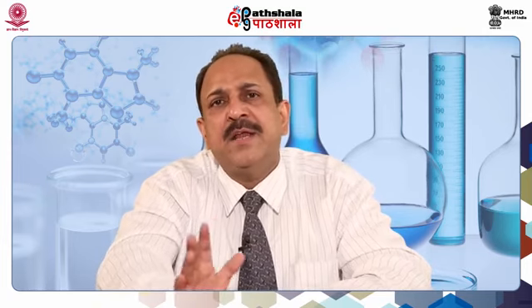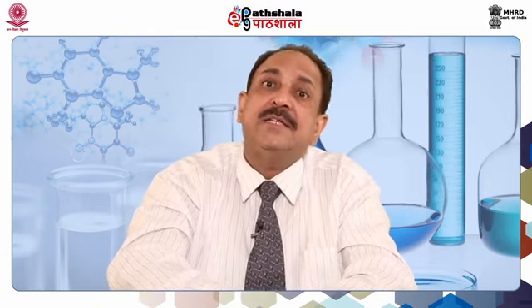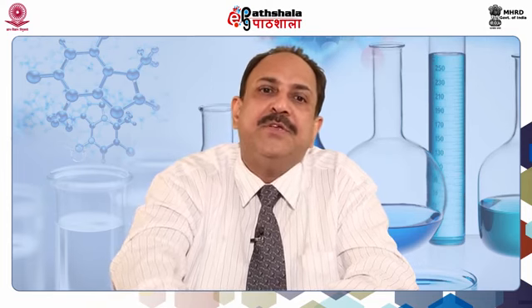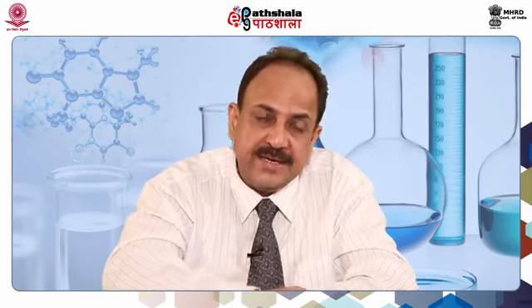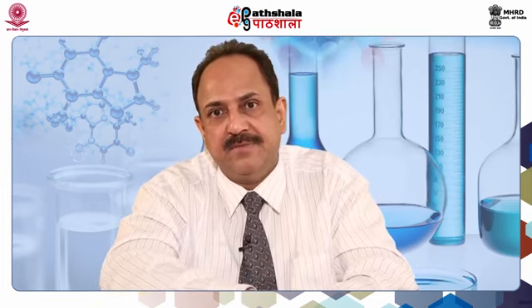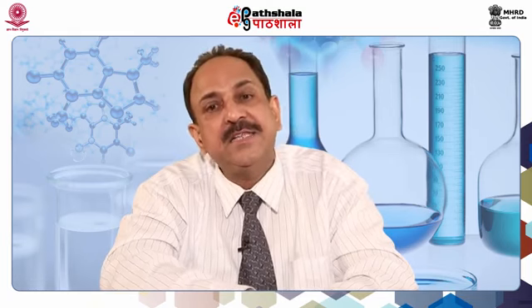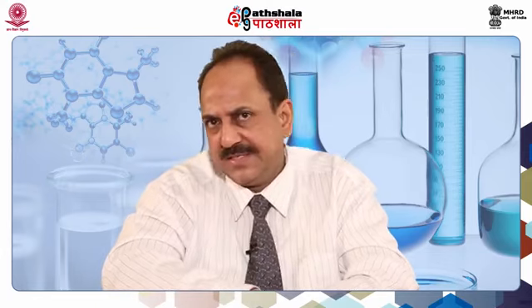We have already seen two online applications, that is JSmol at PDB or SwissPDB, and Cn3D at NCBI Entrez database. In the present module, we will be using SwissPDBViewer. We will be downloading it, installing it on your computer, and then we will be using the enzyme which is bound to the ligands. Two ligands, one is magnesium ion for its functioning and the other is OSB, orthosuccinyl benzoate, which is a product of this enzyme.